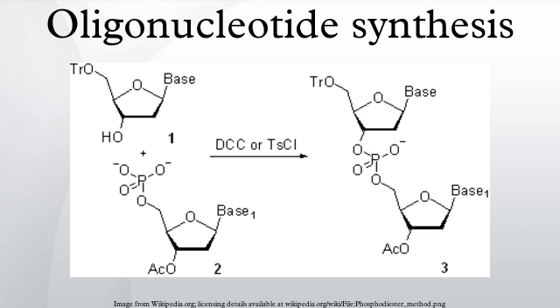Synthesis of oligonucleotide microarrays. One may visualize an oligonucleotide microarray as a miniature multi-well plate where physical dividers between the wells are intentionally removed. With respect to the chemistry, synthesis of oligonucleotide microarrays is different from the conventional oligonucleotide synthesis in two respects.